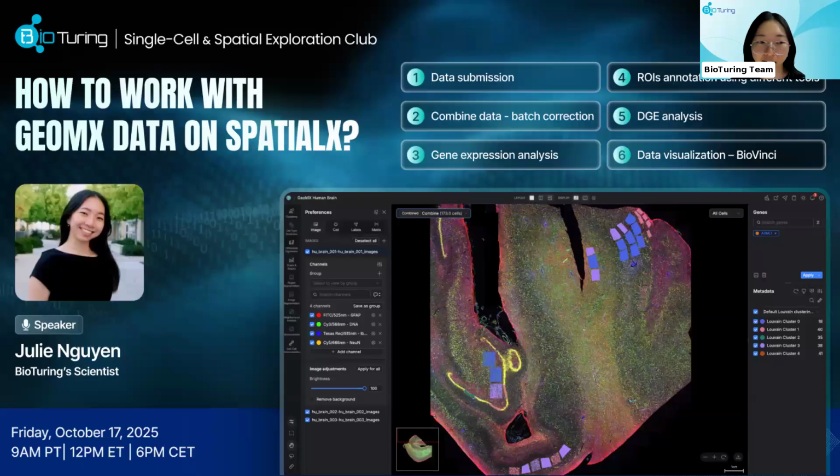My name is Julie. I'm a scientist here at BioTuring, and welcome to this week's Single-cell and Exploration Club. This is where we demonstrate some of the features on our app through the form of a case study. But in particular, this week's club, instead of going through a case study, I actually wanted to go through a guide or a tutorial on how to handle GeoMx DSP spatial data on SpatialX.